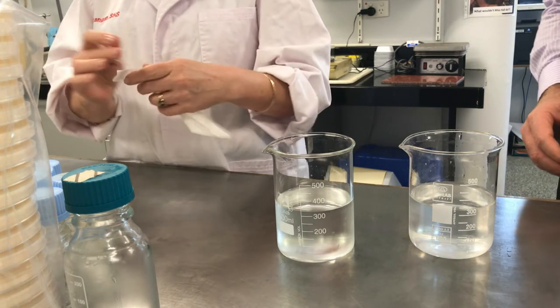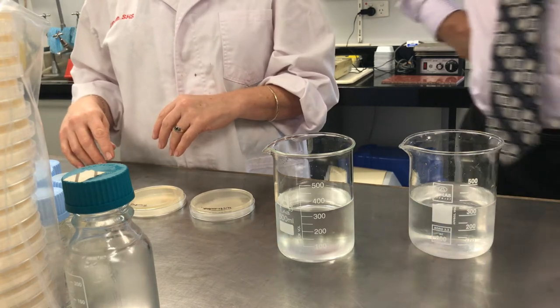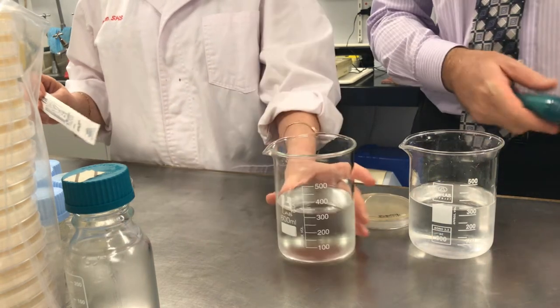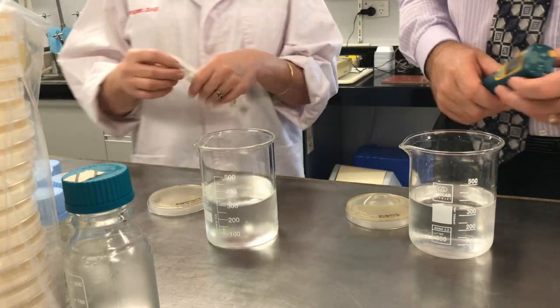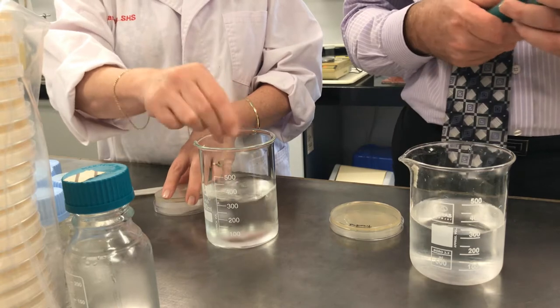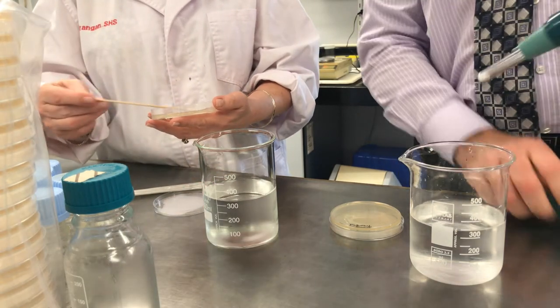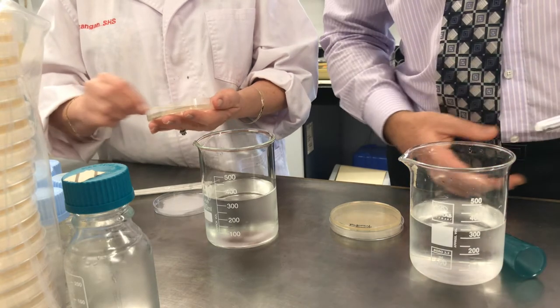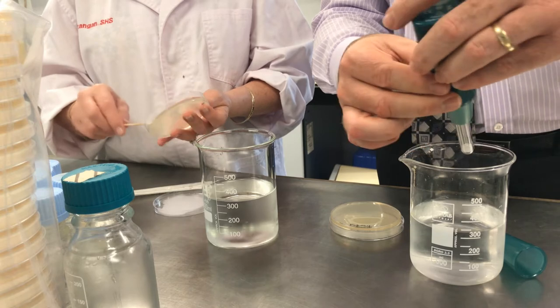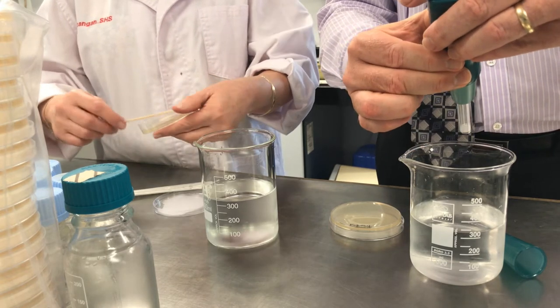Deb has also prepared a couple of agar plates. We've got one that we're going to test with the water after it's gone through the SteriPen, and the other — as you can see — Deb is streaking the untreated solution onto an agar plate using a sterile swab. While Deb's doing that, I'm goofing off and trying to get the SteriPen going.